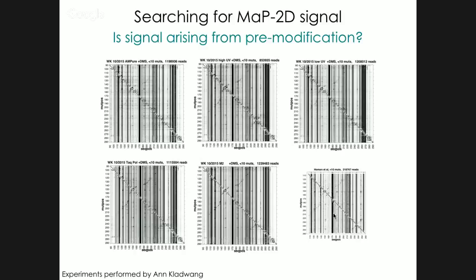This could potentially arise from various steps of the RNA preparation. For example, during PAGE purification of RNAs, it's common to use a UV lamp to shadow, in a technique called UV shadowing, to visualize the bands on a polyacrylamide PAGE purification gel.